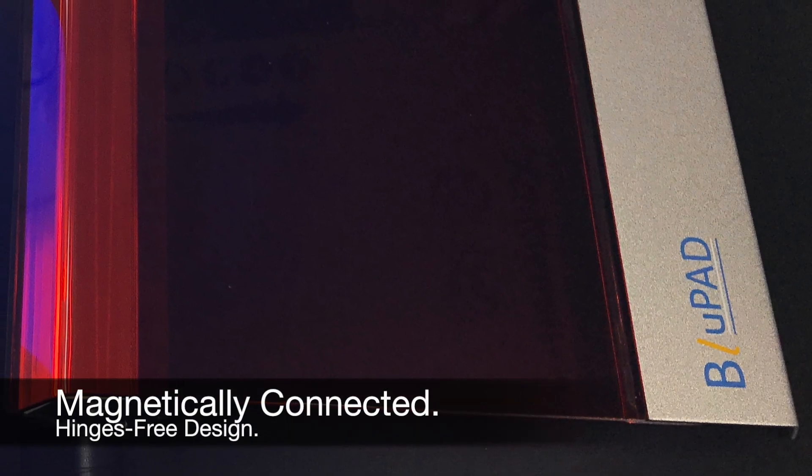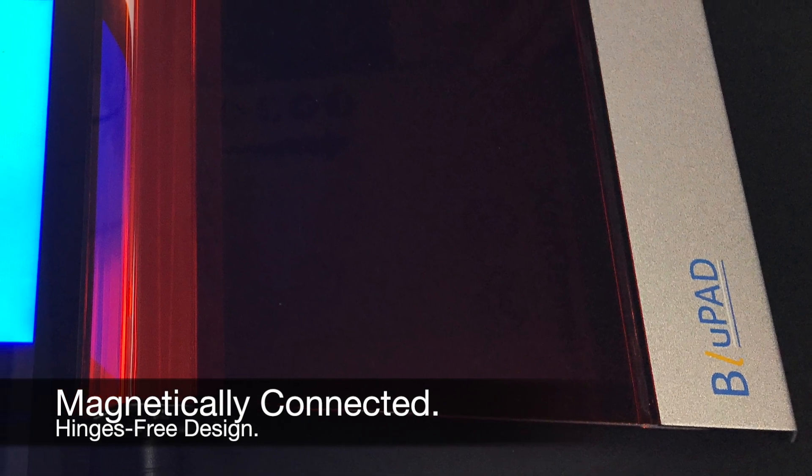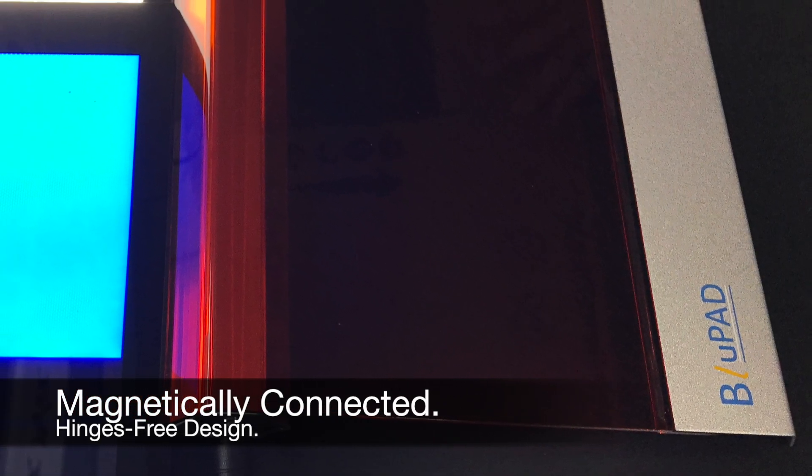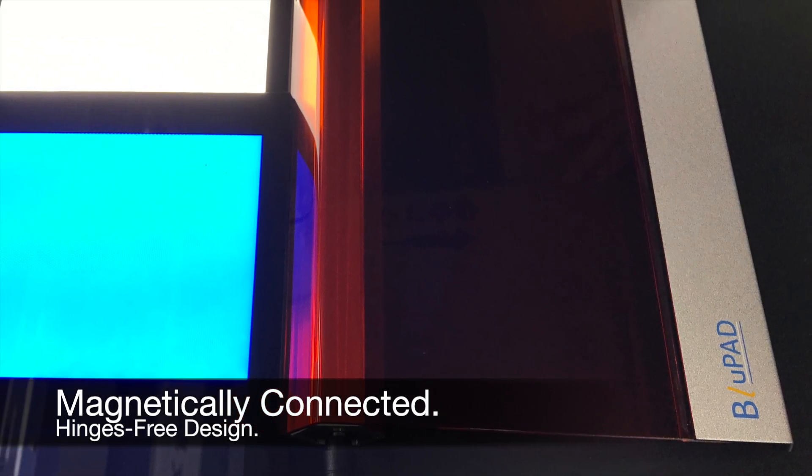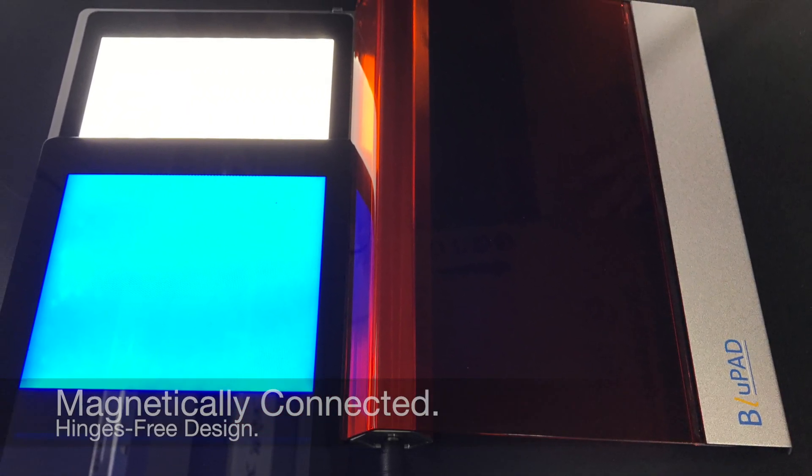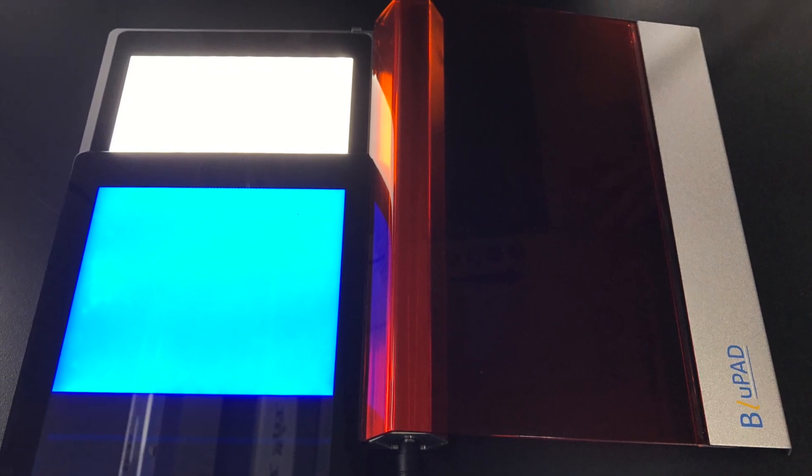The hinges-free amber filter is magnetically connected with the metallic designer base allowing the optimal damage-free international shipment and maximum compatibility with the CCD systems on the market.